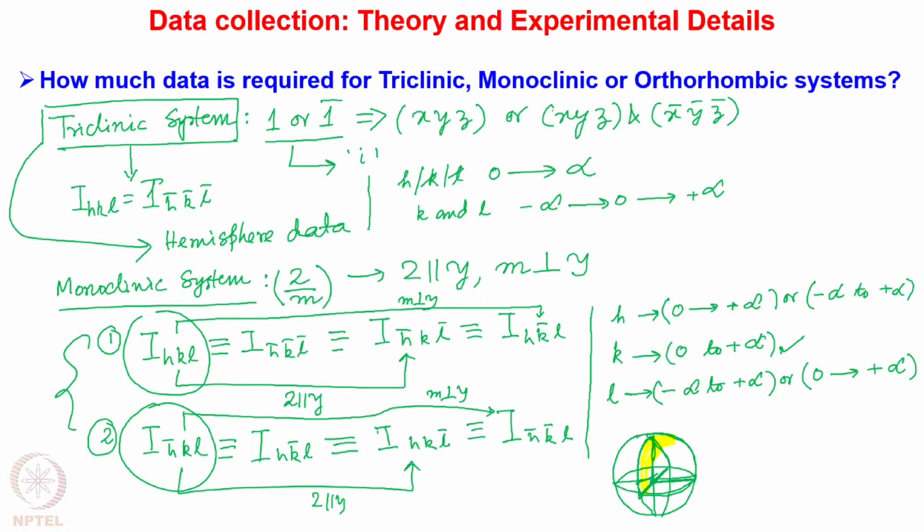So this small region is the 1/4 of the sphere. This can be understood if you consider an orange, and that orange, if it is cut from the middle, is half of the sphere, which is only the upper half, and that upper half, if it is chopped vertical, then what segment we get is 1/4 of the sphere, and we are talking about that 1/4 portion in this particular case.